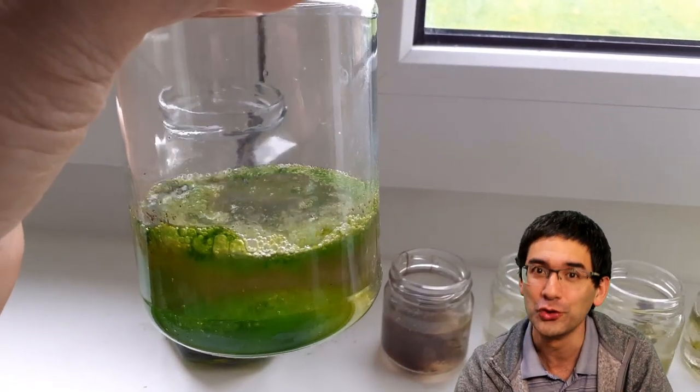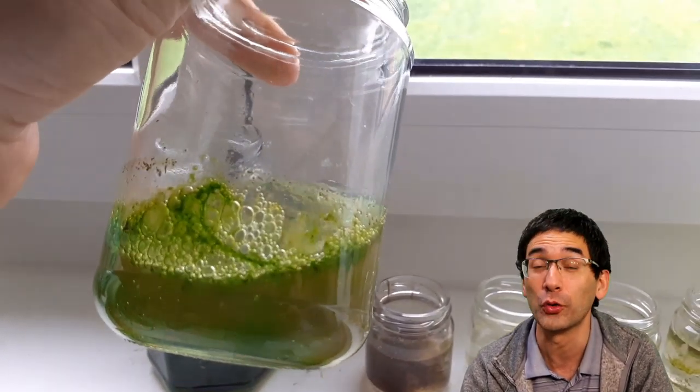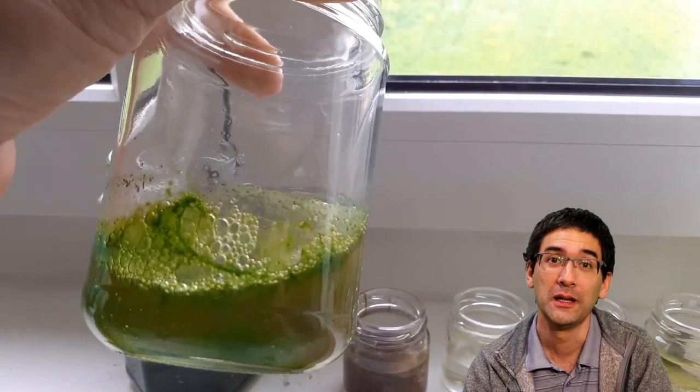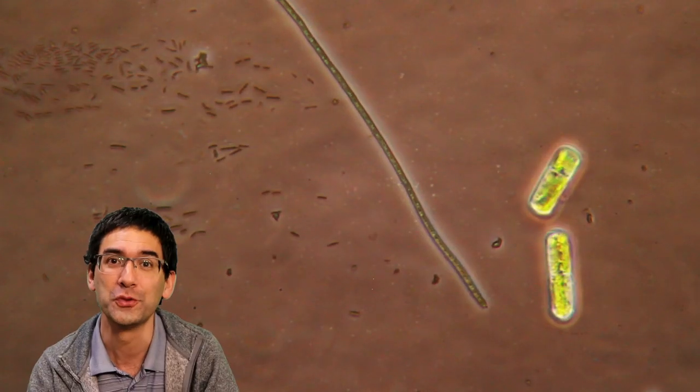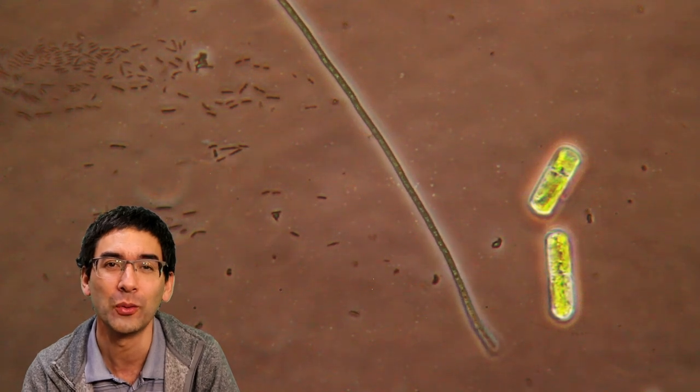In some of them there's more decomposition going on, especially if there's a lot of organic material in the liquid. Sometimes there's not so much decomposition going on. That's a funny thing here – I don't know what that is.